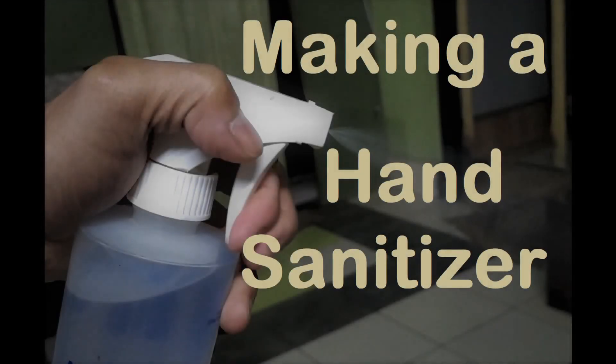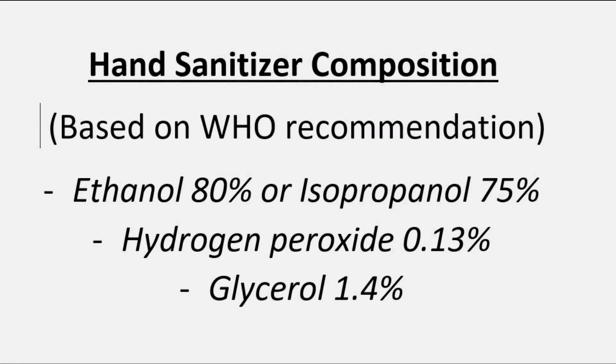In this video, I'll be talking about how to prepare a hand sanitizer both at home and in a laboratory setting. The formula for preparing the hand sanitizer will be strictly based on WHO recommendations. A simple breakdown of the WHO recommendation for a hand sanitizer is as shown here. Ideally, a hand sanitizer should contain these ingredients.